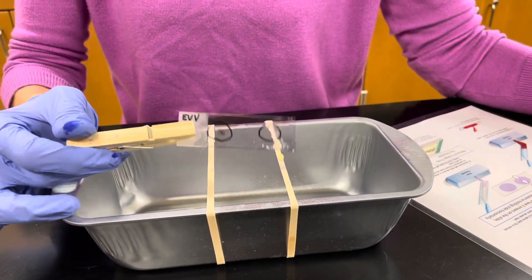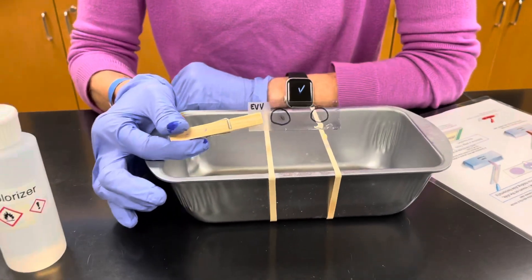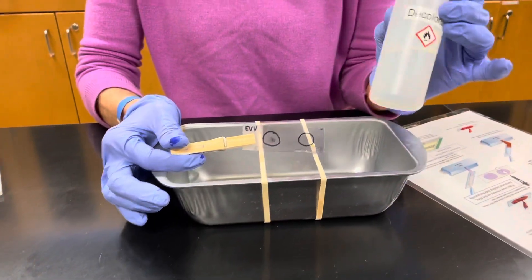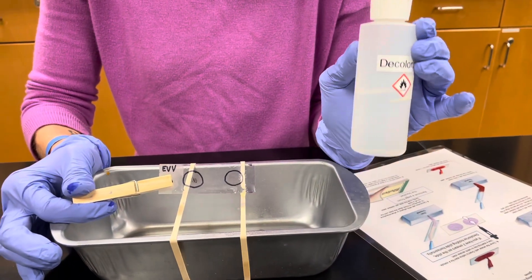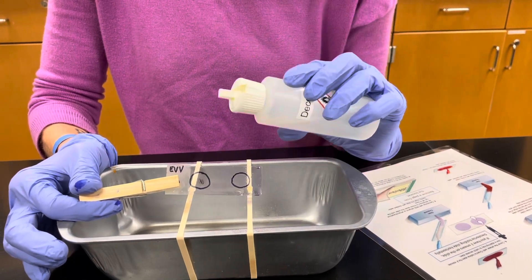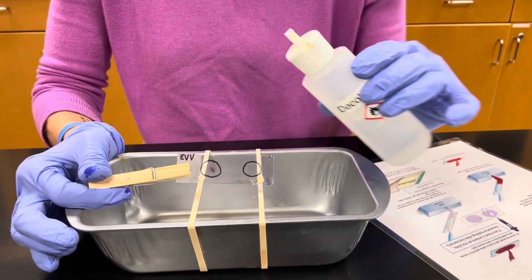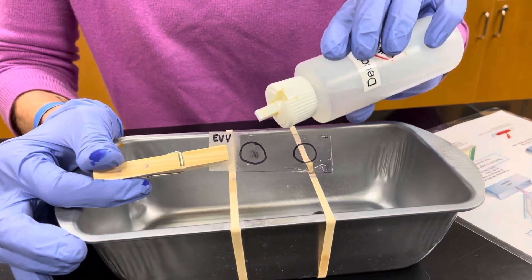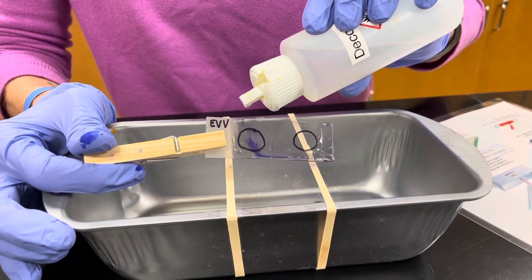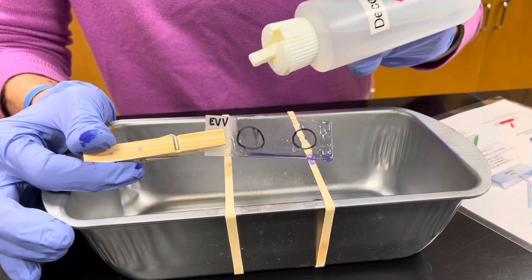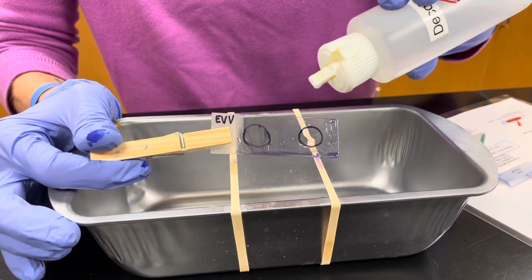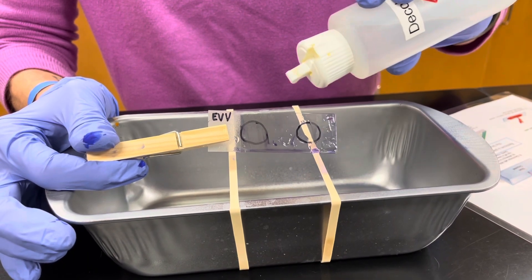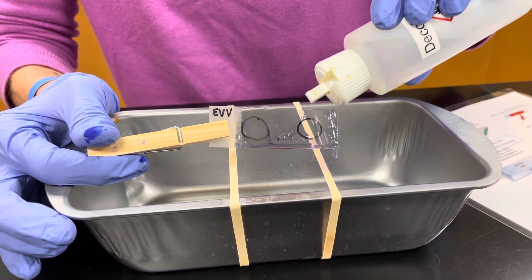The next step is decolorization and it's probably the most critical step in doing a Gram stain. Our decolorizer is ethanol and what you're trying to do, you just want to add enough decolorizer till the purple runs clear. So I'm going to add just drop by drop. Just drop by drop till you no longer see purple running on the other side.